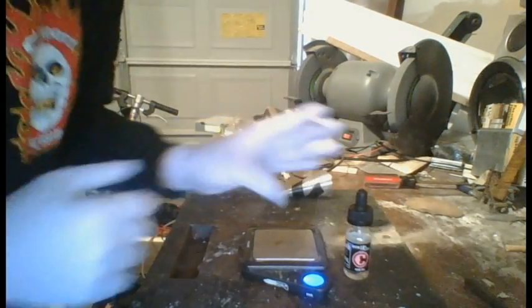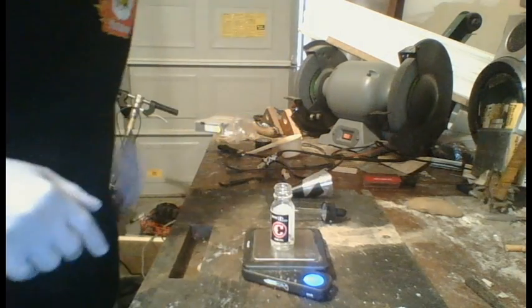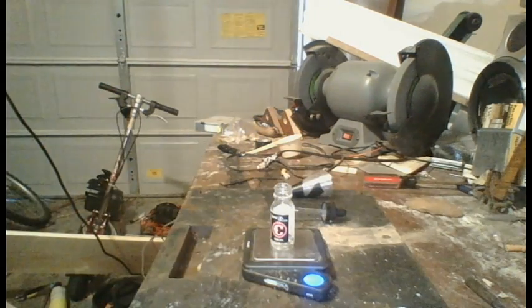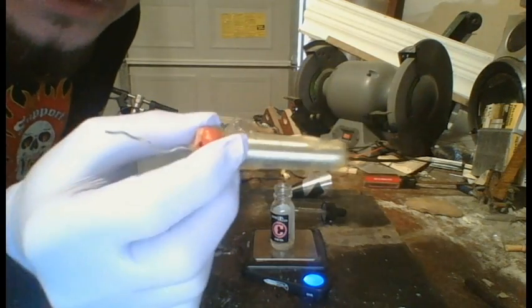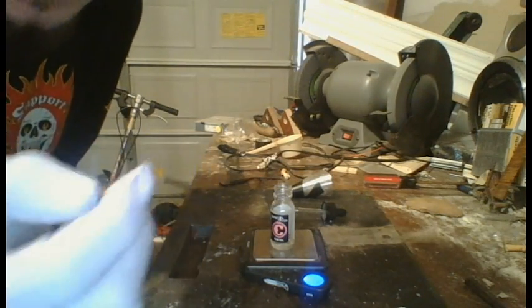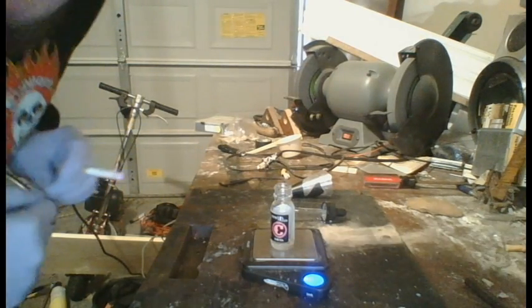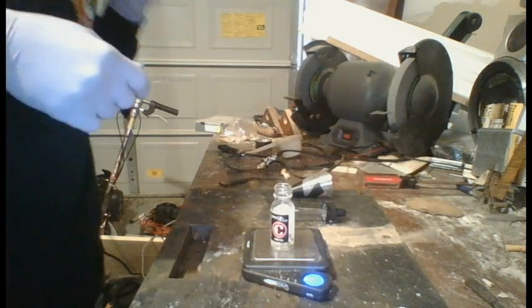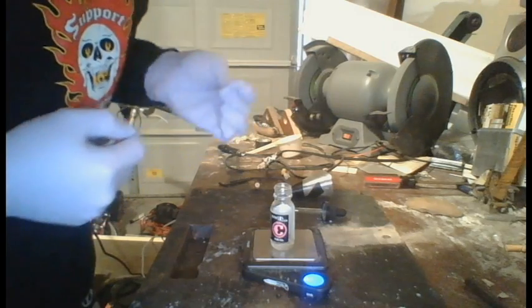I'm going to start by weighing the tincture bottle and taring the scale. I have some old solder that I haven't used — it's like 98% tin and 2% silver. I'm going to add 2 grams of solder.